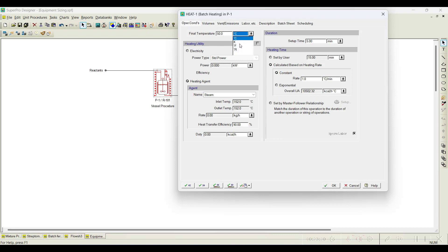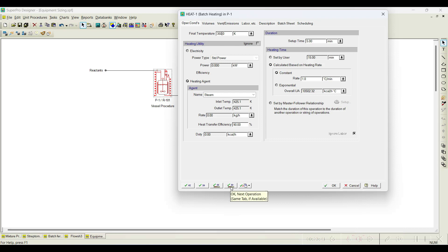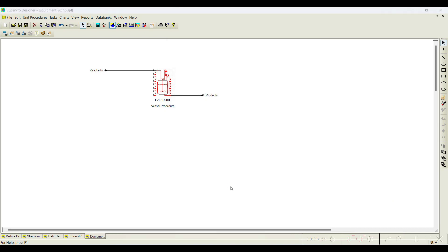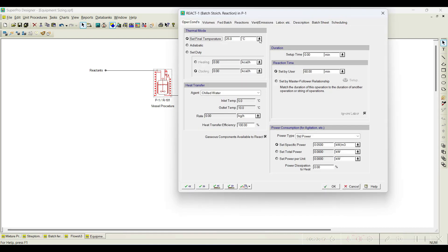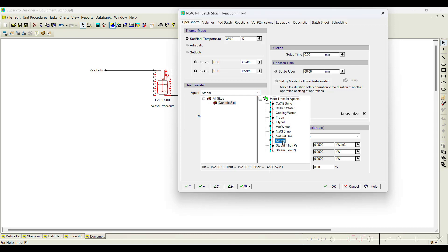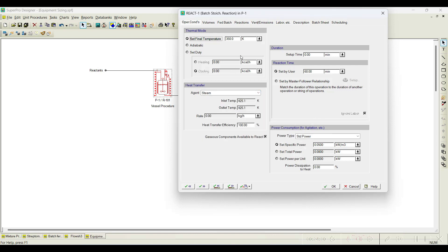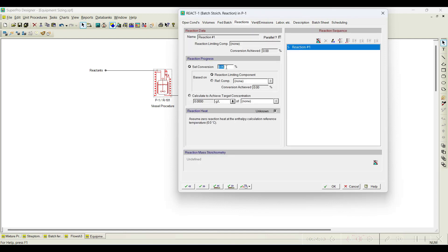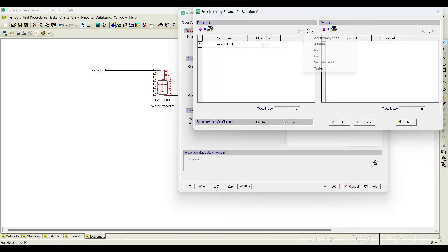Once charged, we need to heat it. From the previous example, we understood we need to heat to 350 Kelvin using steam, with all other values at default. The heating time is 15 minutes, heating rate one degree per minute. The reaction temperature is 350 Kelvin. If cooling is required, we use chilling water; in this case for heating we use steam.